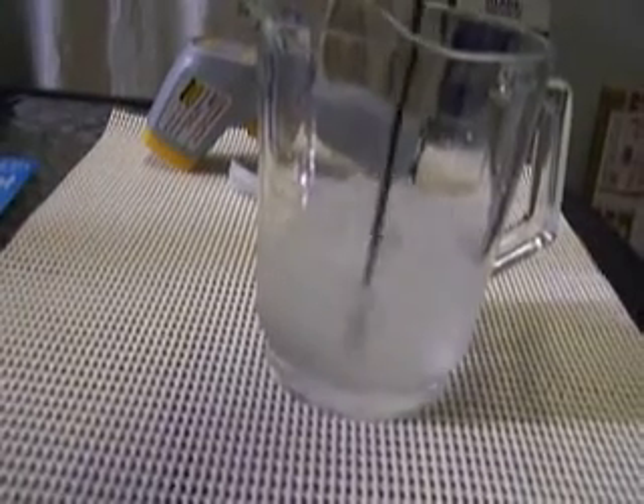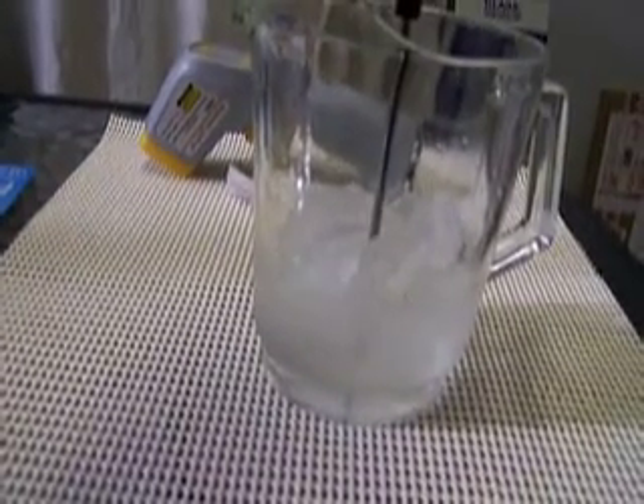Ice melts at zero degrees C, so you need to make it mostly ice and then just get the melting point. When we check a thermometer in this ice slurry it should indicate approximately zero degrees C.